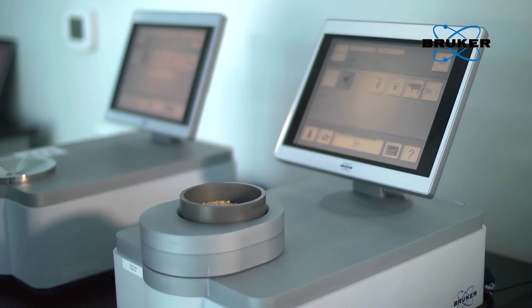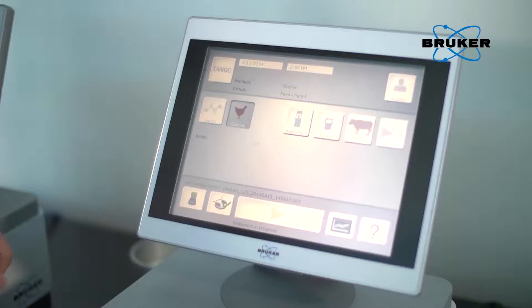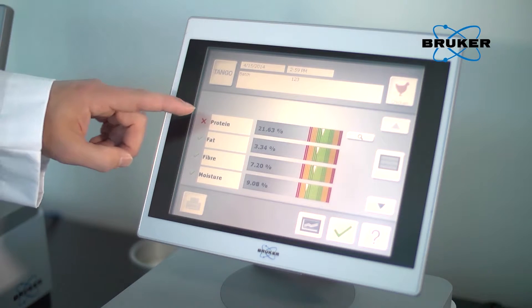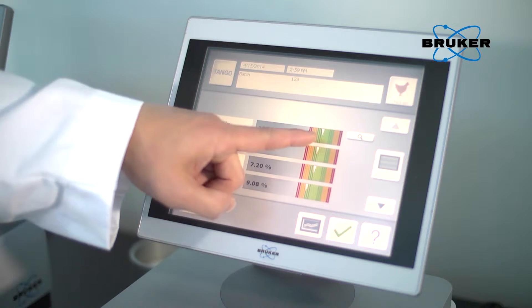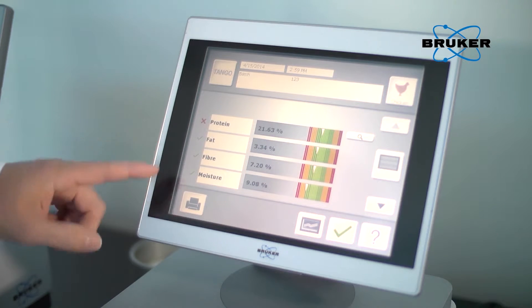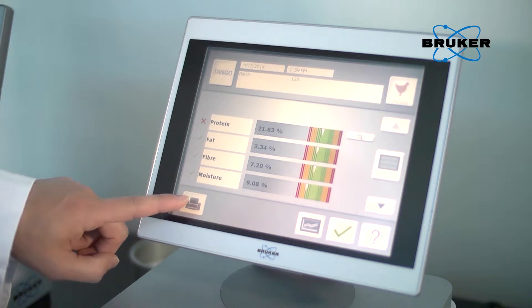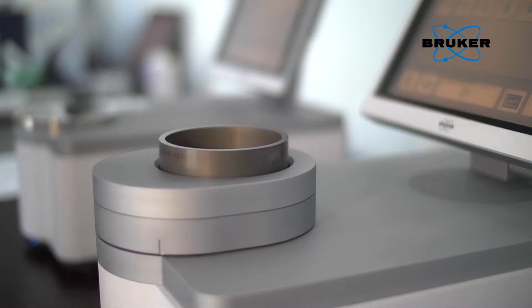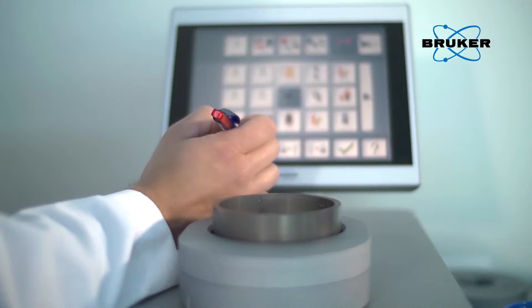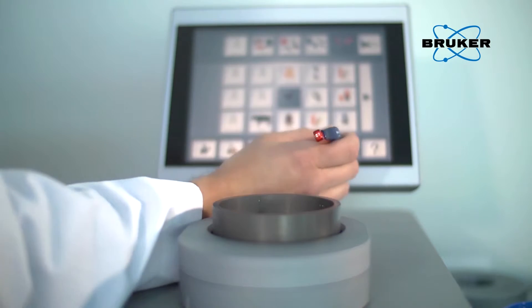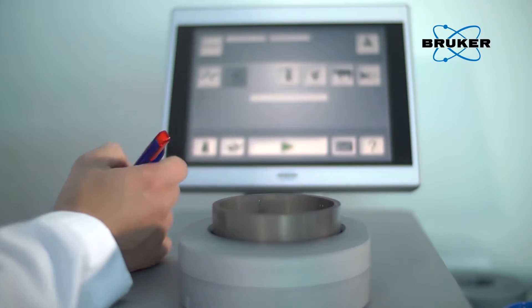After approximately 15 to 30 seconds, the measurement is complete. The result view shows the quality of the analyzed product immediately. With one last push of a button, the stored result can be exported by USB at any time. With the Tango, we've addressed ease of use through the introduction of a capacitive touchscreen interface driven by an icon-based software.